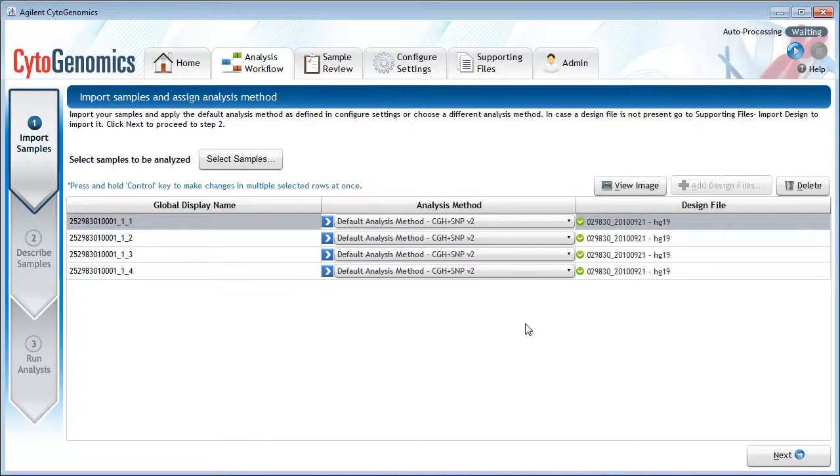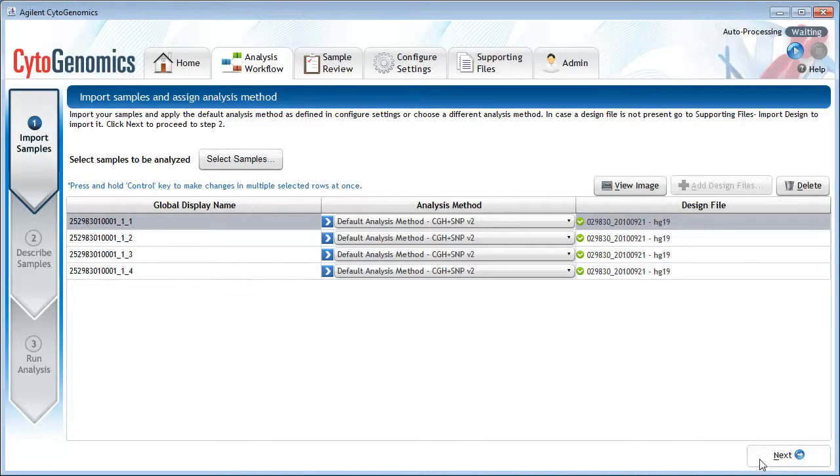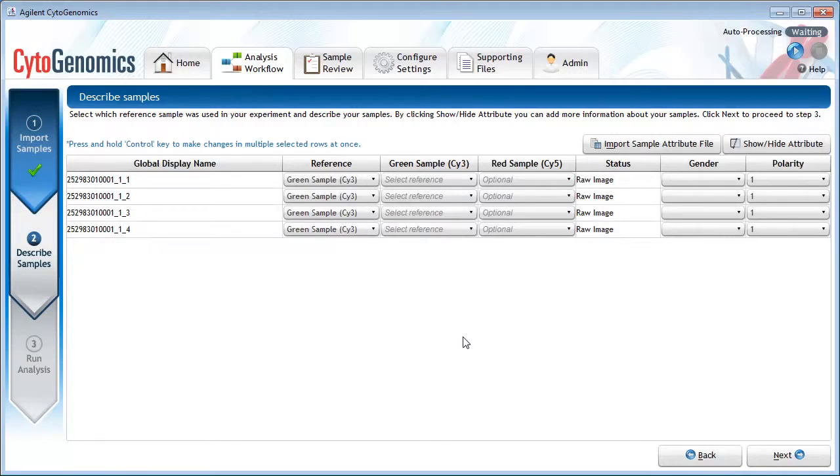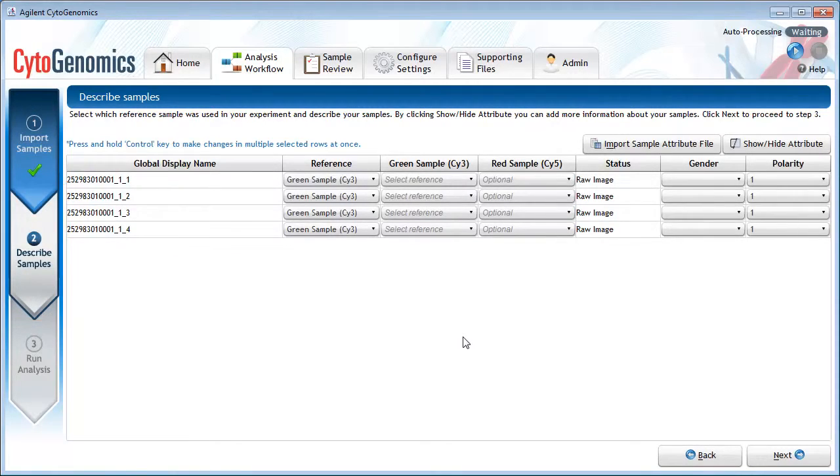At this point, you can click Select Samples again to add additional samples or click Next to proceed to the next step. We are now on the Describe Samples step. On this screen, you need to set at the very minimum the required sample attributes.